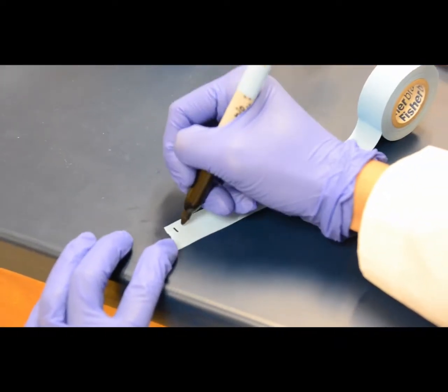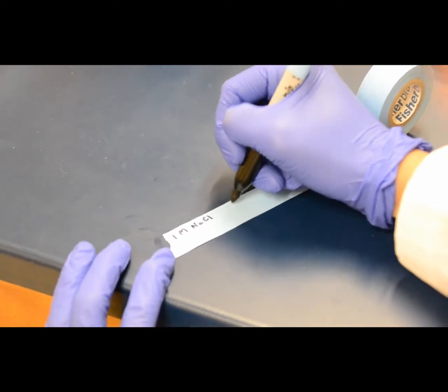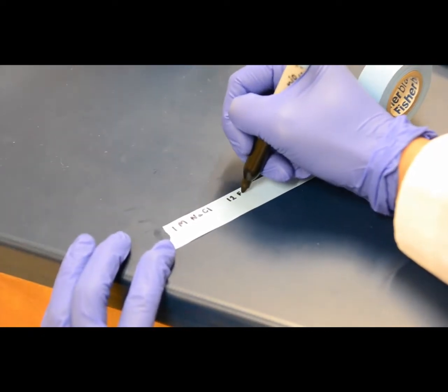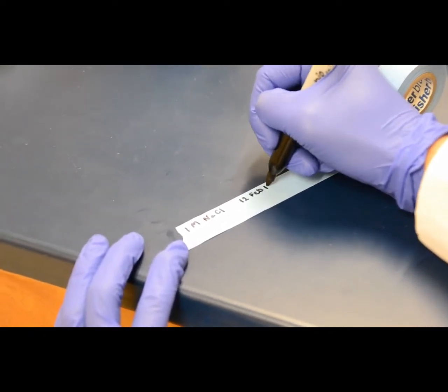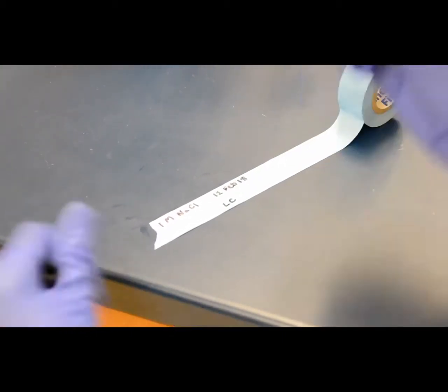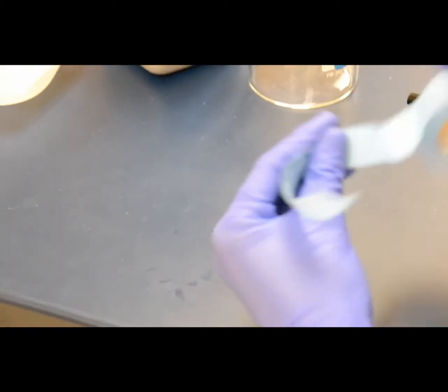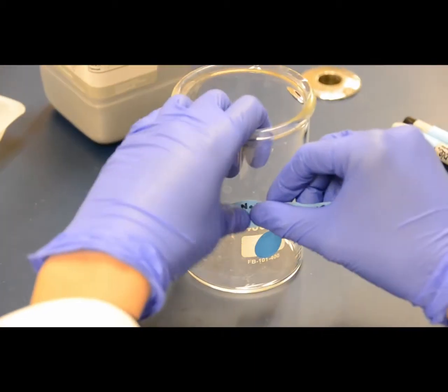So the first thing you should do before making any solution is bust out some tape and write out a label with the name of the solution, any relevant details like concentration or pH, the date you were making the solution with 2 digits for the number, 3 letters for the month, and 2 digits for the year, and your initials. You want to place this label on the beaker you are making a solution in.